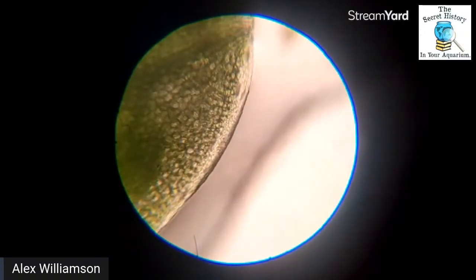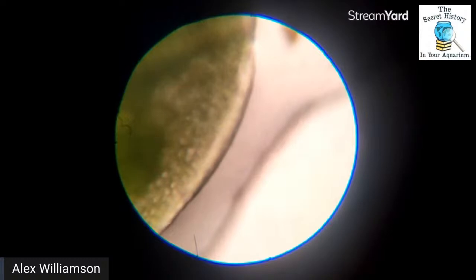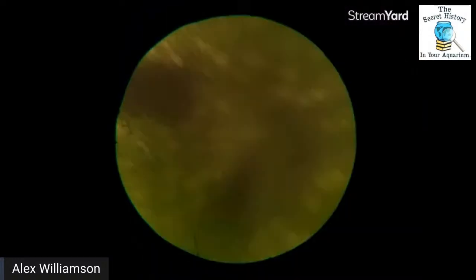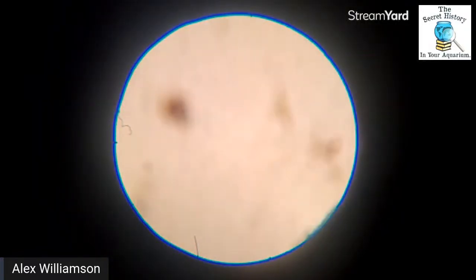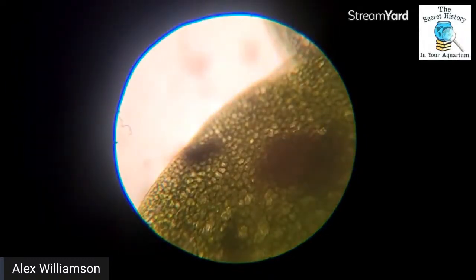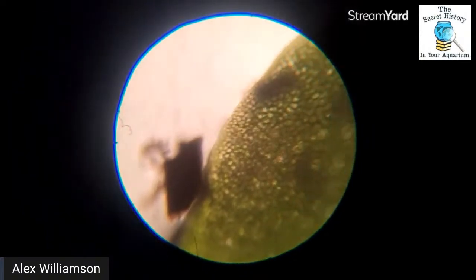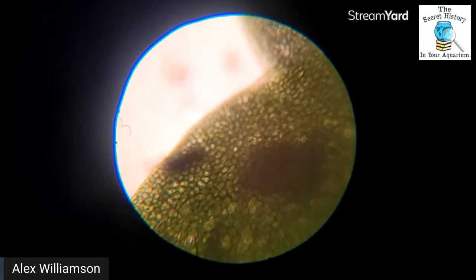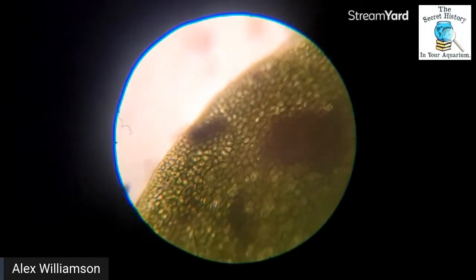Well, when monks were studying these first cells, some of the cells out there in certain species are actually big enough that you can make out the nucleus and everything. Sometimes you need contrast dye. These are actually very small cells because this is a very small plant. Let me get some Vallisneria and show you that.